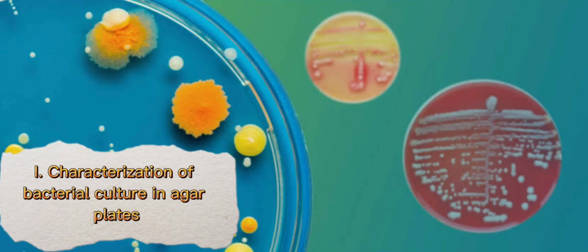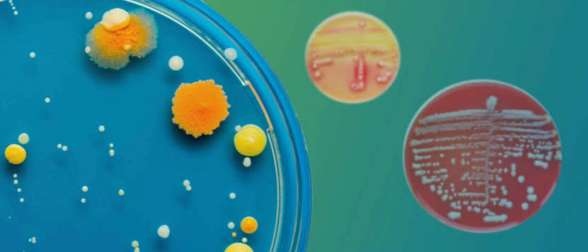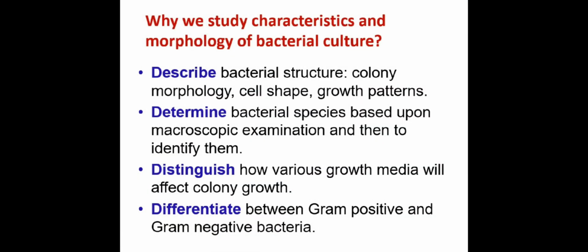Characterization of bacterial culture in agar plates. We study characteristics and morphology of bacterial culture to describe bacterial structure, to determine bacterial species, to distinguish how various growth media will affect colony growth, and to differentiate between gram-positive and gram-negative bacteria.